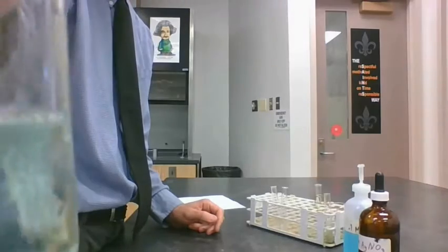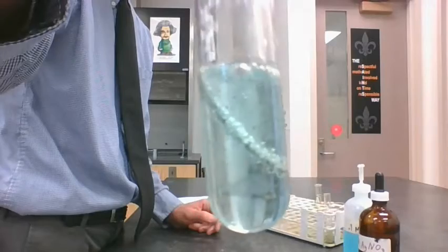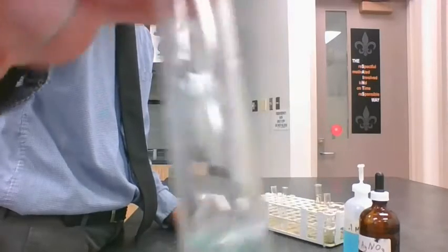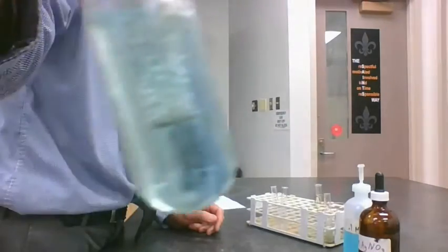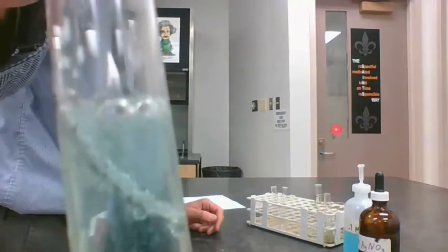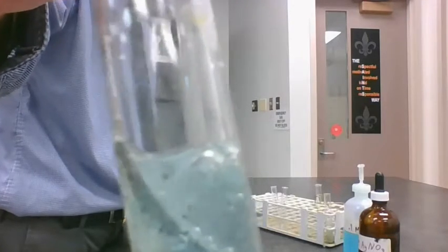And let's see if you can see what's going to happen in there. Looks like there's some bubbles forming on the strip. Maybe a little hard to see, but there's some bubbles forming on that shiny piece of magnesium. I can hear it a little bit.